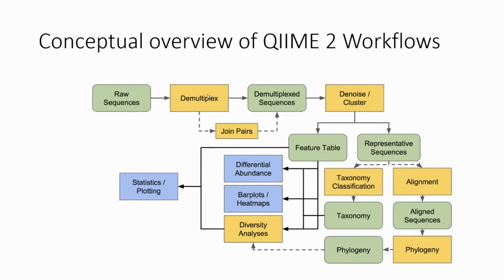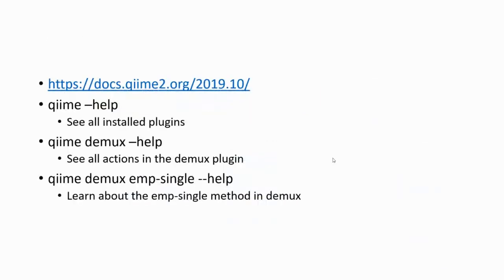So that's the main goal: you have this NGS data, go through this process, and get this readable information that you can use for further analysis. This is a very simple workflow for the QIIME tool that we will use.